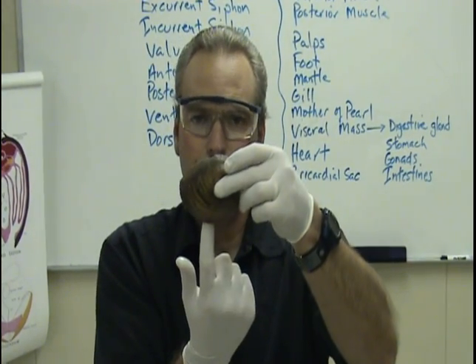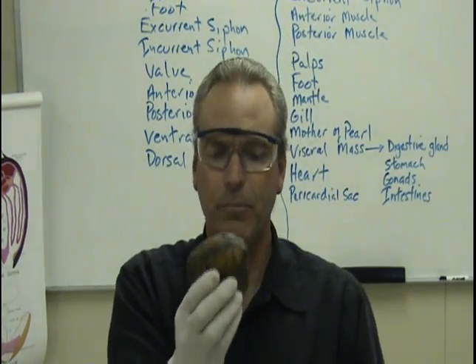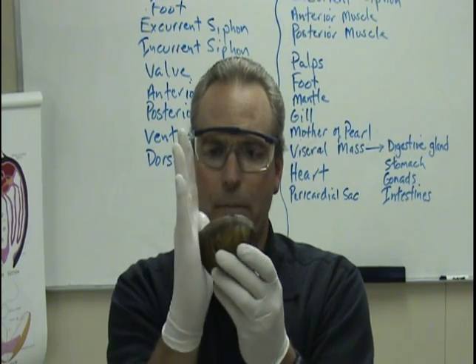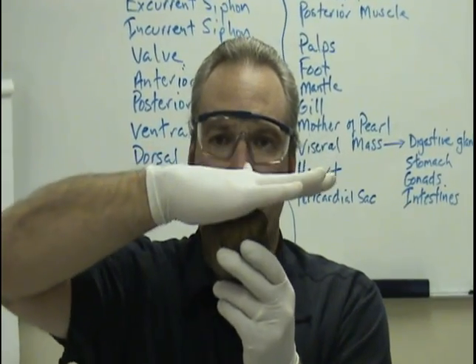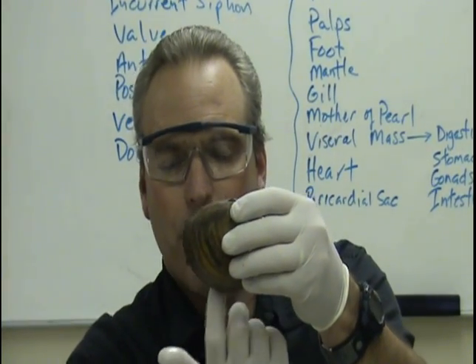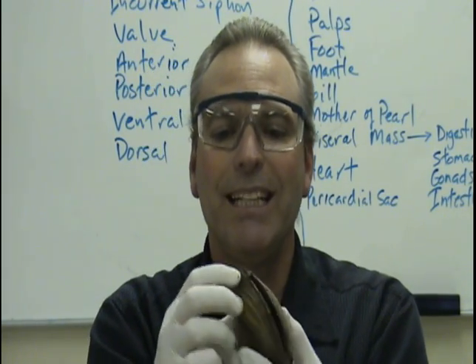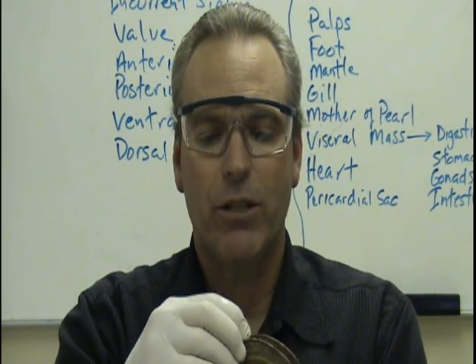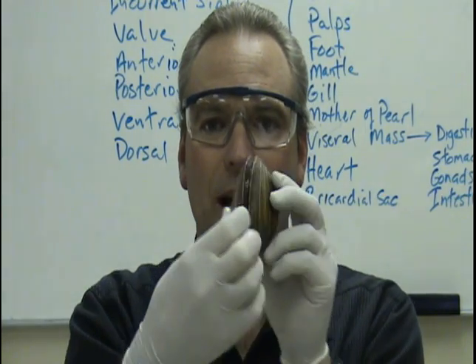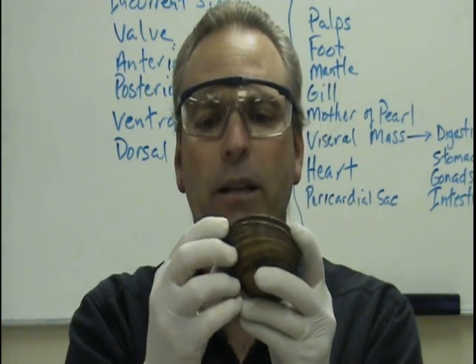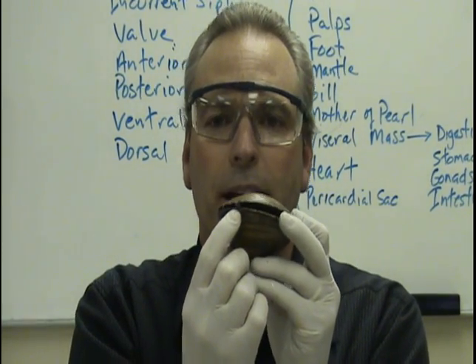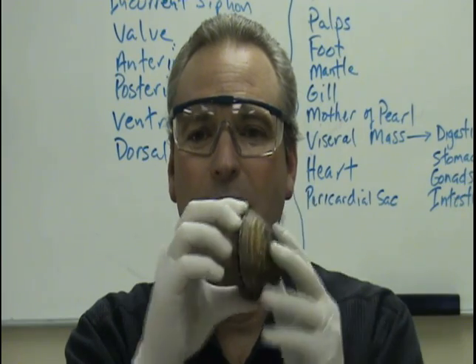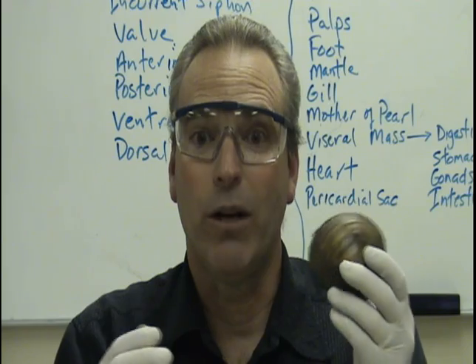Ventral is where the opening is. So let's go over that again: the anterior is where the umbo is, the posterior is opposite to that, the dorsal is the top where the hinge is, and the ventral is where the opening is on the bottom. Most clams will have a little tiny piece of wood in the valves so that you can stick your scalpel inside and cut the adductor muscles. If your wood chip is not present, it's really hard to open the valve.